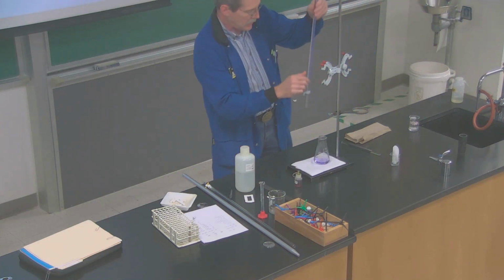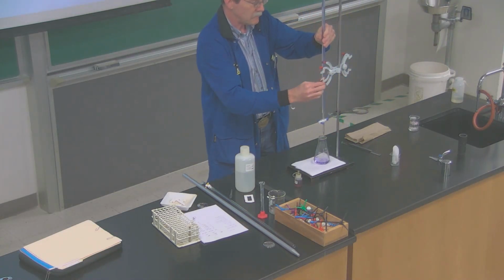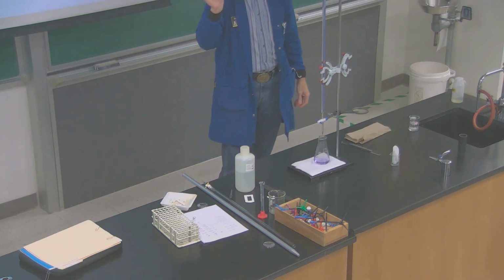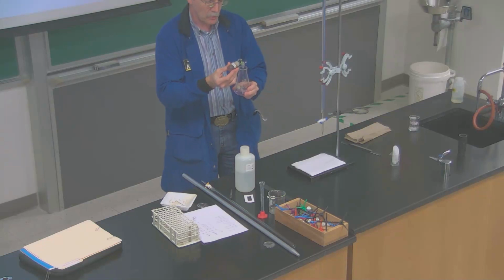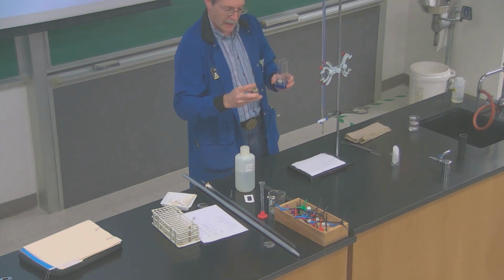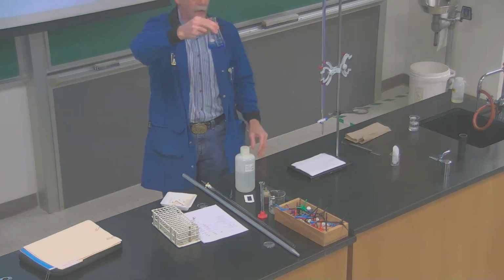And we're going to do the titration. So we do want to get a little bit in that tip. Remember to debubble that. And then we're going to do our titration. The indicator we're using this time is not phenolphthalein. We're using something called bromocresol green. This has a basic or a deprotonated form that is blue and an acidic form that is yellow-orange. So we're going to put a few drops of this in, and you can see it went from that pale lavender color that it was initially to blue. This is the indicator we're looking at now.